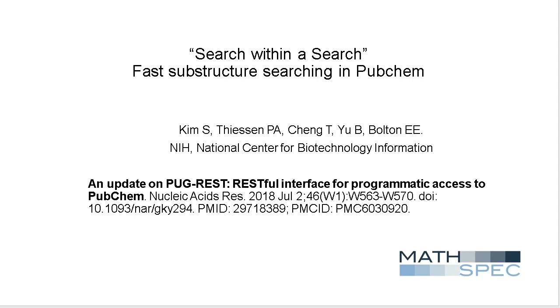To make substructure searching more practicable, scientists at the National Center for Biotechnology Information recently developed fast substructure searching, which limits the PubChem search space to a single molecular formula. Fast substructure searching has now been incorporated into our Excel add-in as a new worksheet called Search Within. About 120 small subformulas have been designated in SMARTS substructure notation and stored in the Excel add-in.